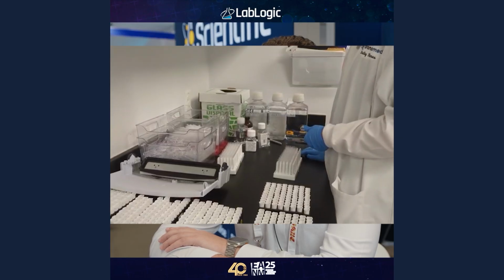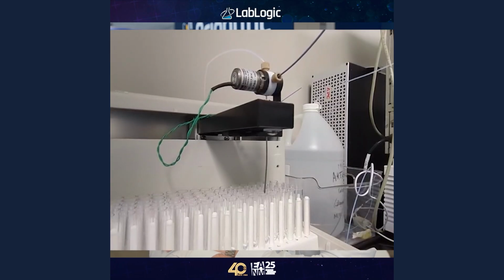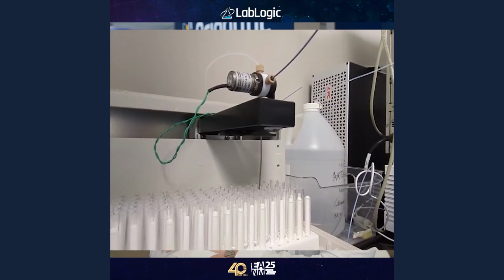Currently, what we've been doing is fraction collection and then counting them in an autogamma counter with a multi-channel analyzer to discriminate between Lead-212 and the daughters, for two different reasons. The bismuth complex has a different retention time of the peptide than the lead complex. And because of the Compton scattering, it is interfering in the Lead-212 window, because the multi-channel analyzer is not capable of taking into account the continuum.